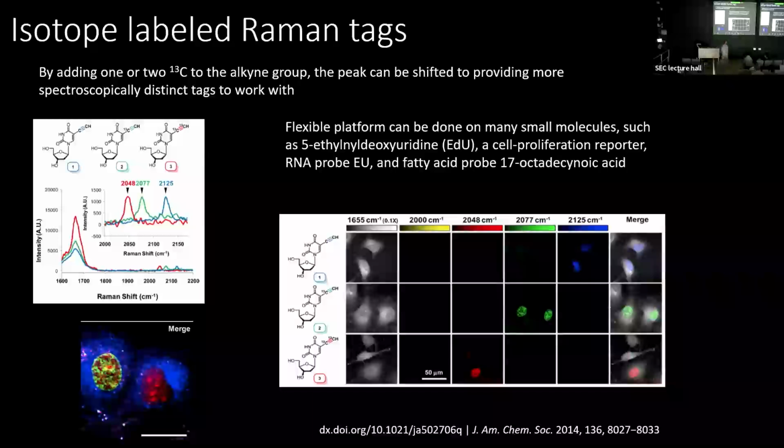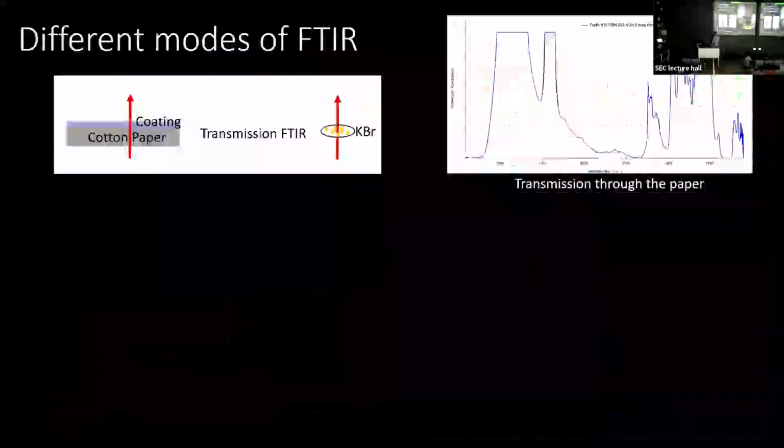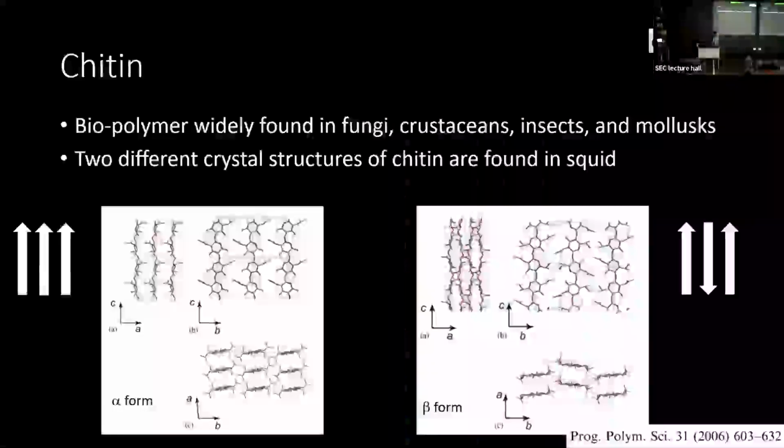Right. All right. So I'll repeat the question for the people on Zoom. The question is, will the surface enhanced Raman detect small changes in a biomarker? So the surface enhanced Raman is going to lower our detection limit so we can measure a much lower concentration of the biomarker. The changes in the biomarker are still going to be in the spectra. Let me jump back to the chitin.